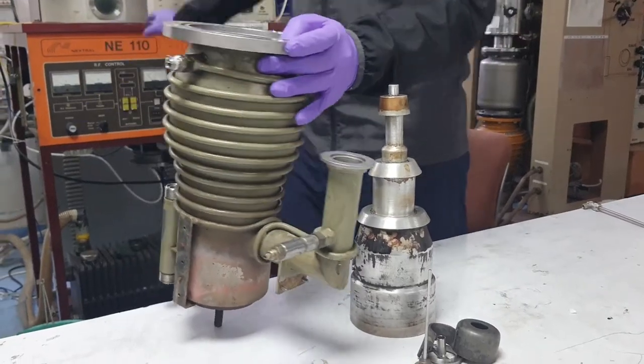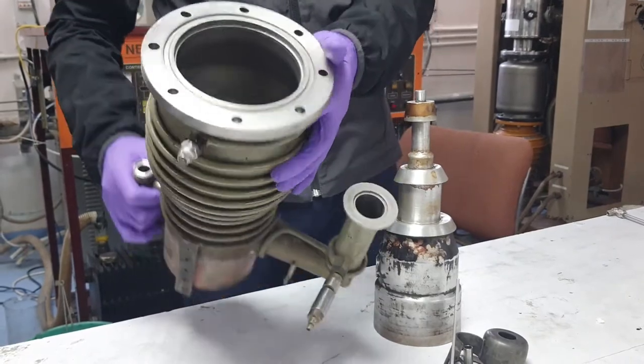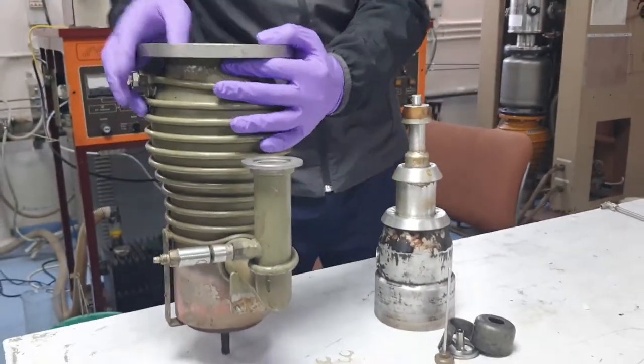This is the diffusion pump for reactive ion etching. This is the metallic outer casing for the diffusion pump, and this is how it looks like from inside. And this is the jet assembly.